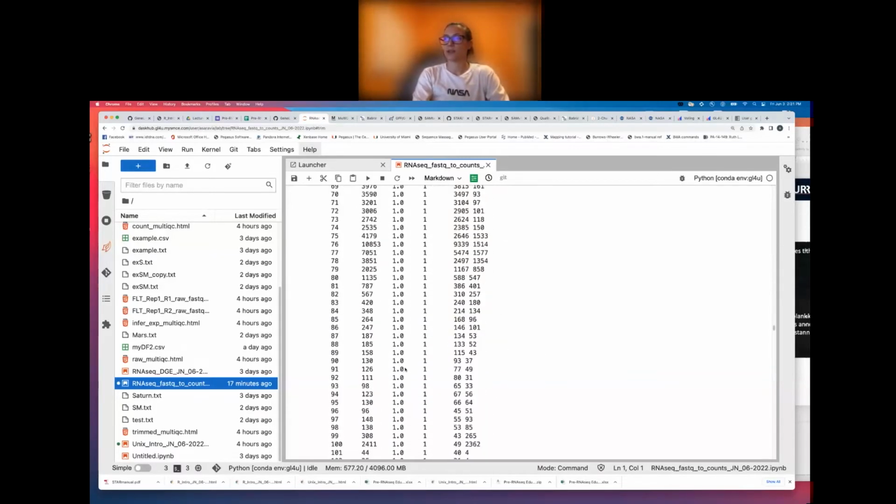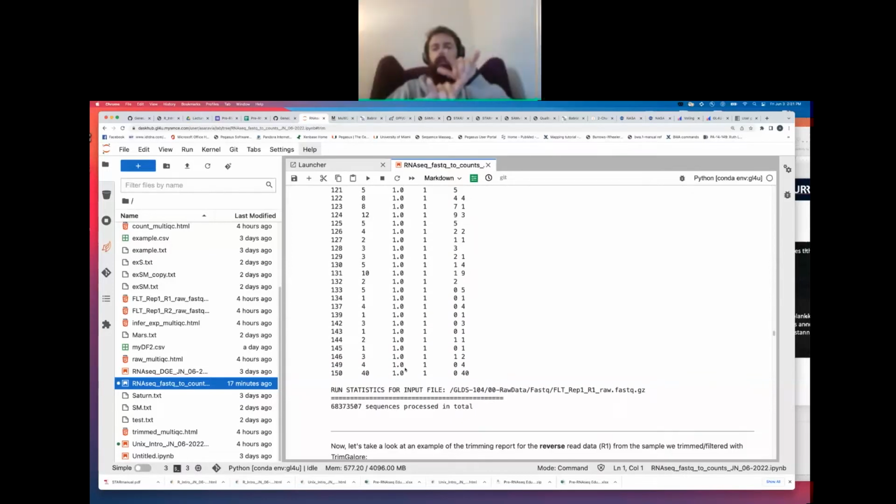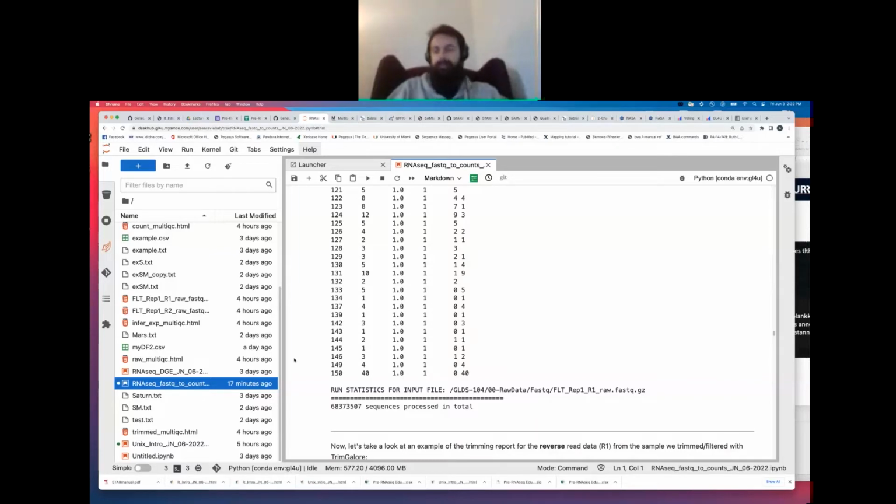Is everyone getting that? If we're removing opposite ends of each read, like if we're left with 20 on the far end and 20 at the front end, or 21 on either end, what does it do then in that case? Because they're not perfectly going to marry up, are they? Like when we align reverse to forward. It can handle that. Yeah, that's fine. Okay, yep. And that's true, and that does happen, right?